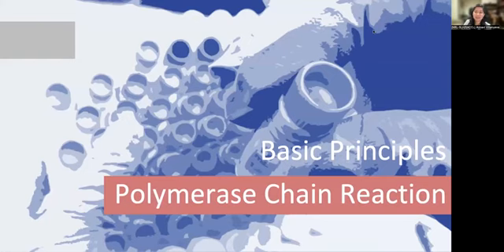I'm Dr. Ana V. Villanueva, a physician researcher from the National Reference Laboratory for HIV, AIDS, hepatitis, and other sexually transmitted infections. My background is in molecular medicine, and today I will be discussing with you the basics of one of the newer technologies that is quickly gaining popularity among clinical laboratories, the polymerase chain reaction, or PCR.